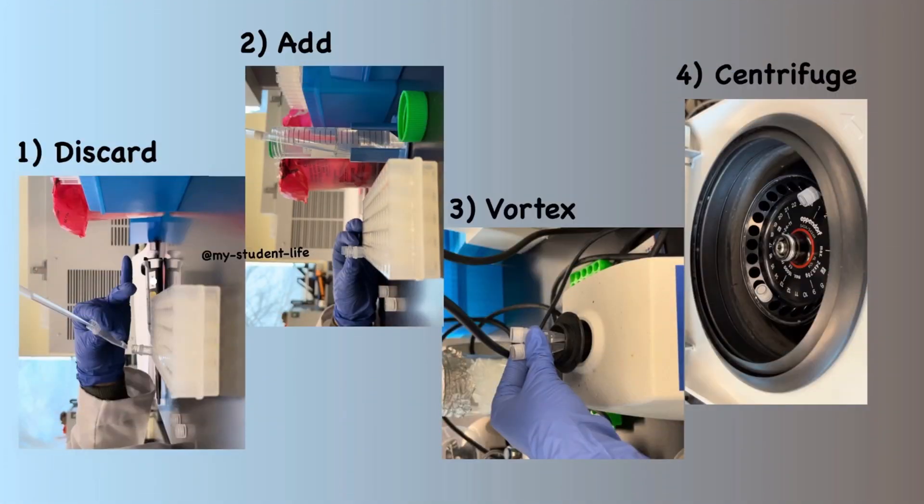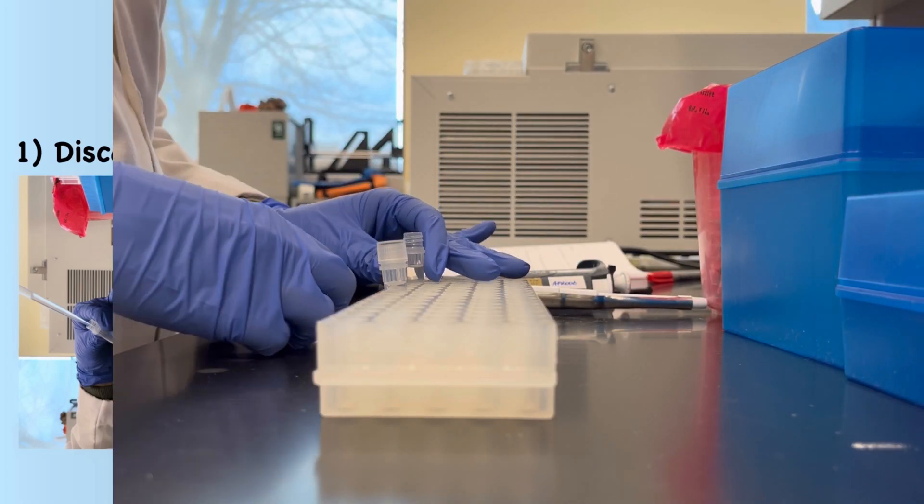After discarding the ethanol, add 1 ml of ethanol, vortex it, and centrifuge it again. This would be the last wash.